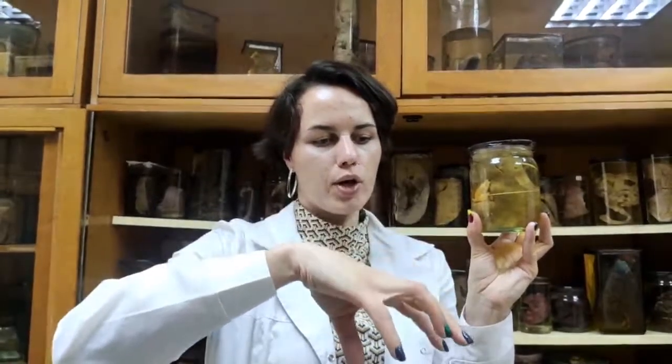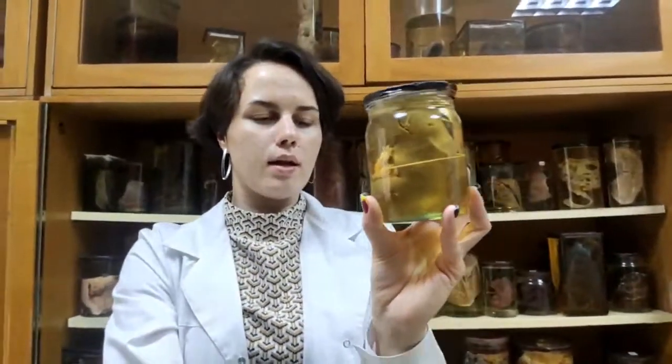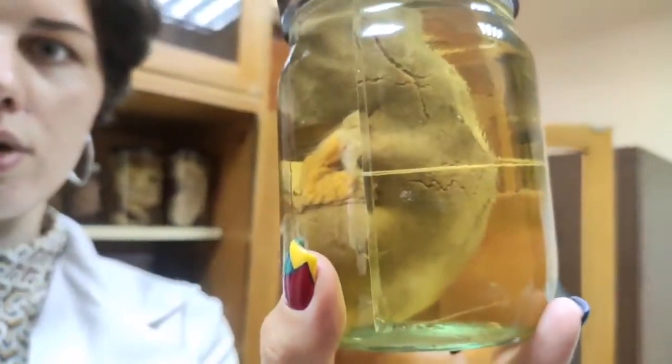In this slide, you also have such a specimen. You should see crescent-shaped fibrin accumulations in the capsule of the glomerulus. And macroscopically, the kidney looks enlarged, and on the surface of the kidney you can see, maybe here it's not really well seen, but usually a lot of small red dots.